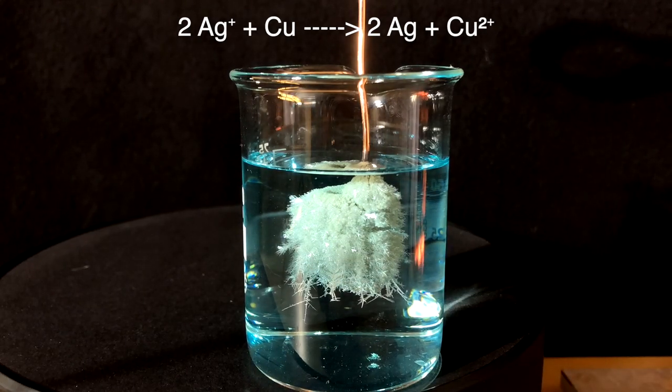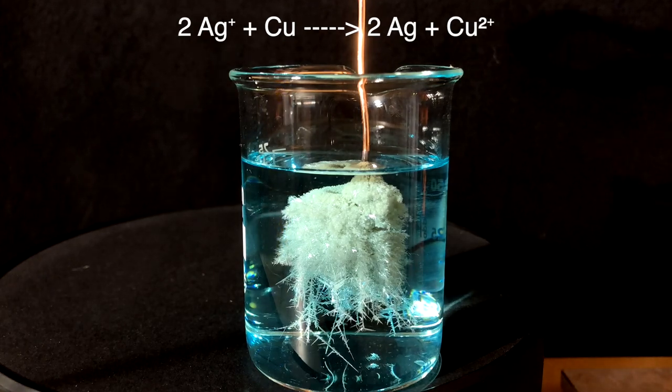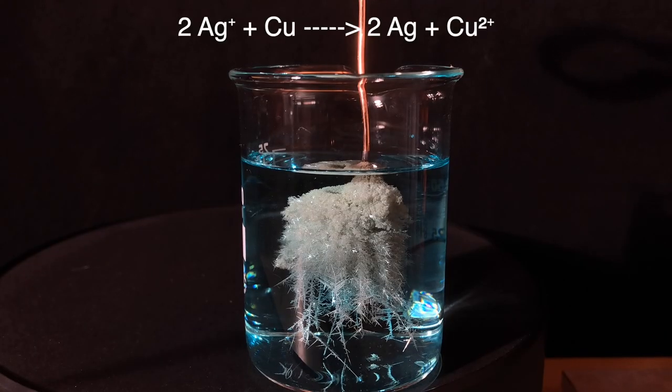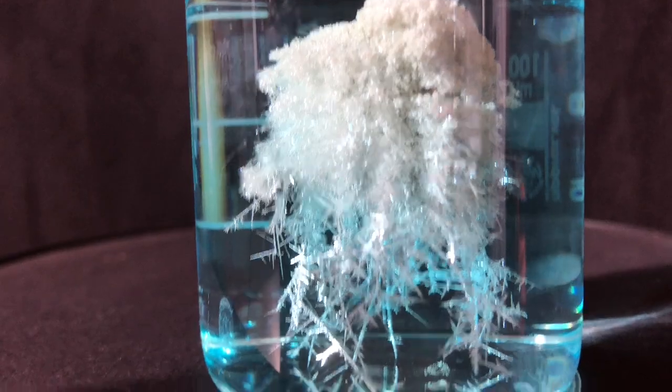The silver plus ions from the silver nitrate solution react with elemental copper to form elemental silver and copper 2 plus ions. You can see that copper 2 plus ions are being formed because the solution took on a blue color.